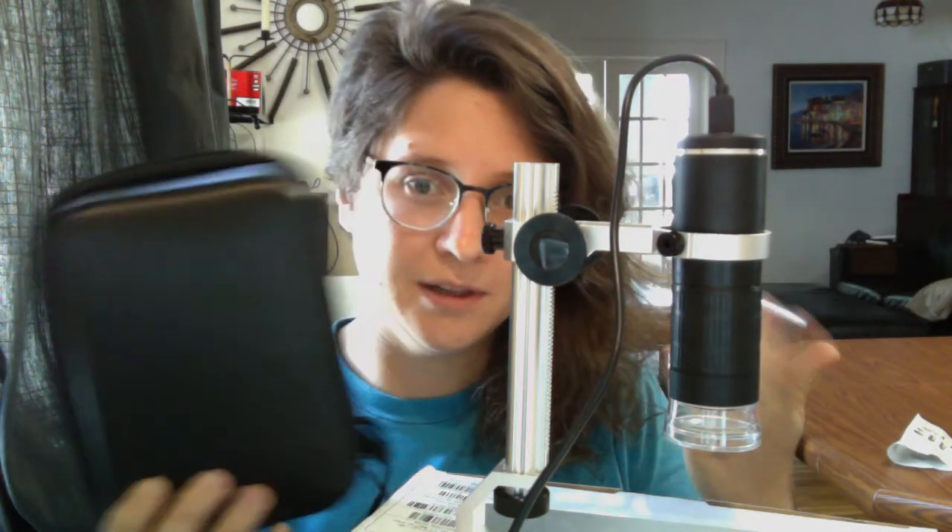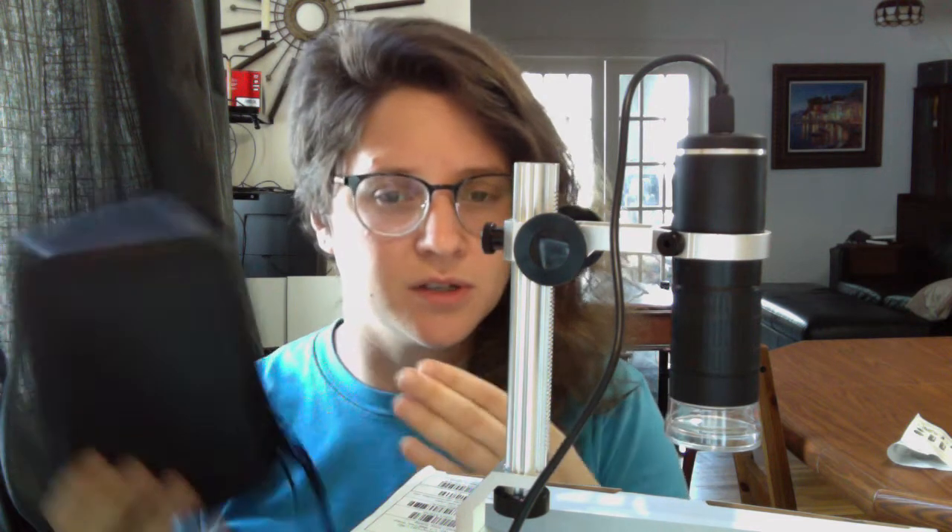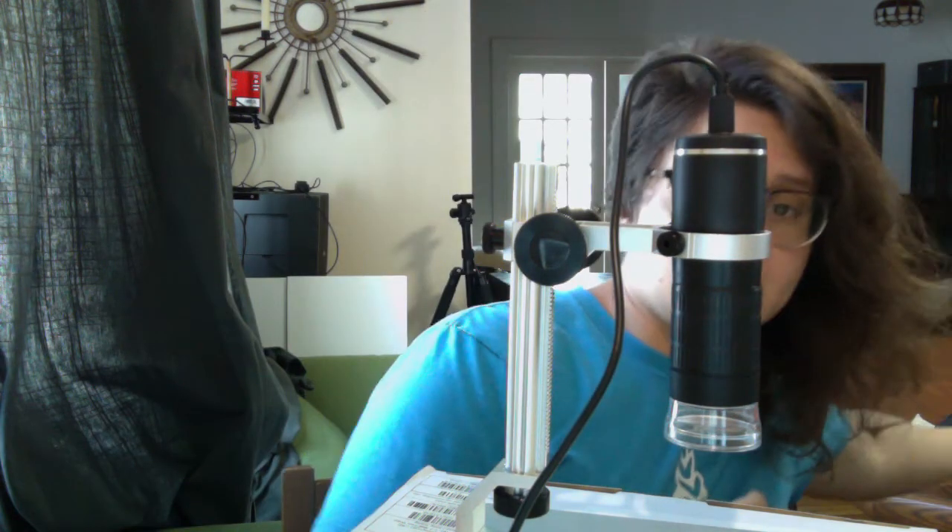This model, when you buy it, comes in this little carrying case, which is cute, but it actually doesn't fit in here once you assemble it. It does come with a little Allen wrench, so when you're traveling you can break it down and store it. Once you do have it assembled — it only took me a couple of minutes — this is basically what it looks like.